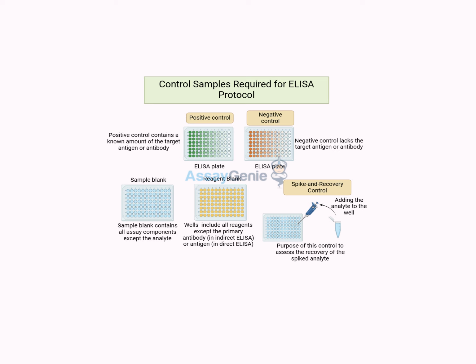Right. You've done some ELISA work before, I think you said. Yeah, definitely. Quite a bit, actually. So you're probably pretty familiar with how antibodies bind to antigens and all that. For sure. But have you ever thought about all the things that could go wrong in that process? Oh, absolutely. There are so many places where things can go sideways. It's kind of like baking a cake. You can have all the best ingredients and the perfect recipe, but if your oven temperature's off or you forget the baking powder, the whole thing's going to totally flop.